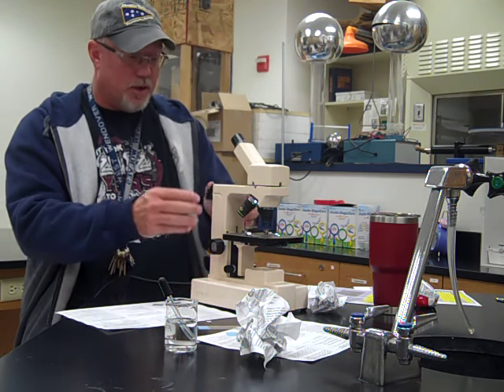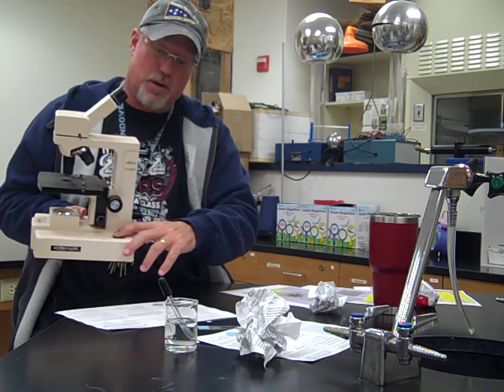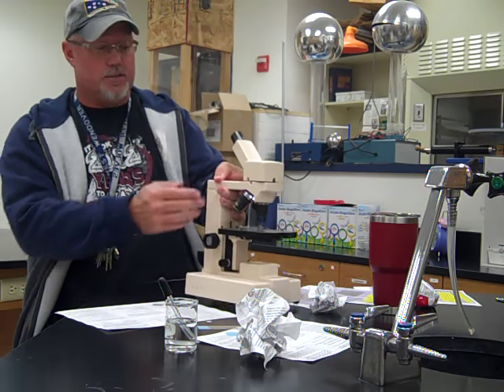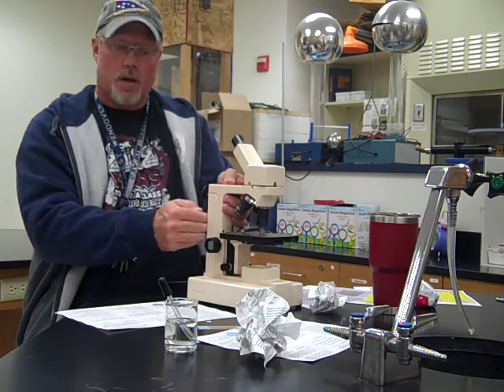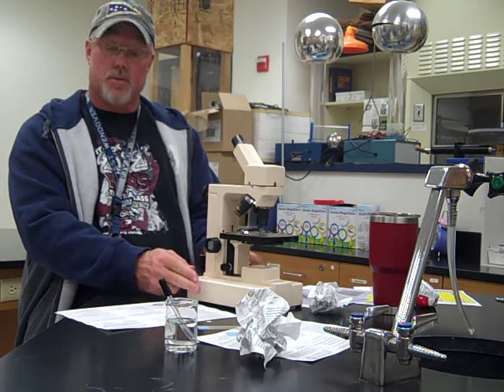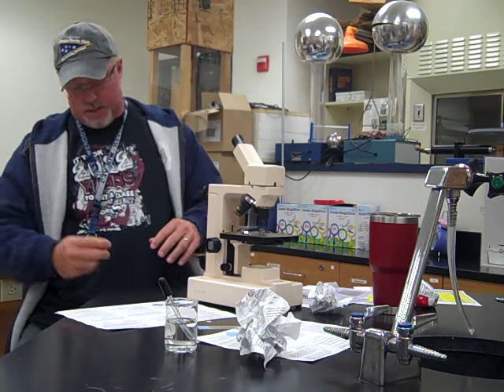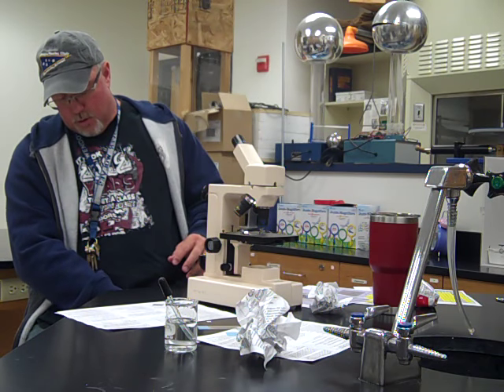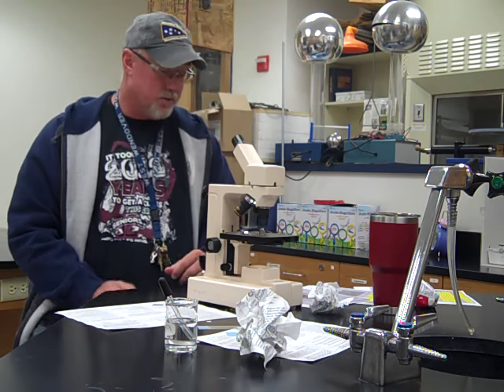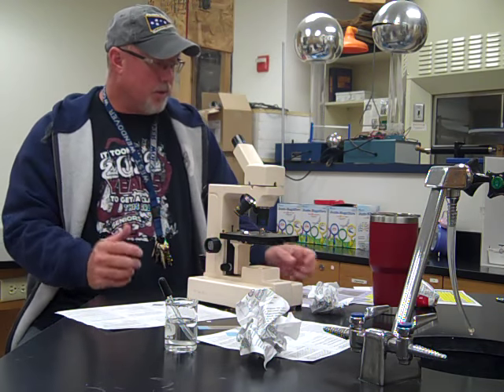A couple other things: on the side of these microscopes, you have the power. You flip this on or off to turn on and off the illumination. What I grabbed here is what we call the arm of the microscope. We'll talk more about that as we go. Then two last things: you have your base, which is what it sits on, and your power cord, which is your power source. You're going to plug this into the outlet that is right below the microscope. When you turn it on, you'll be able to see the light flash on, and then you know that it's ready to go, so you can start looking at stuff in regards to your microscope. So those are the parts of the microscope.